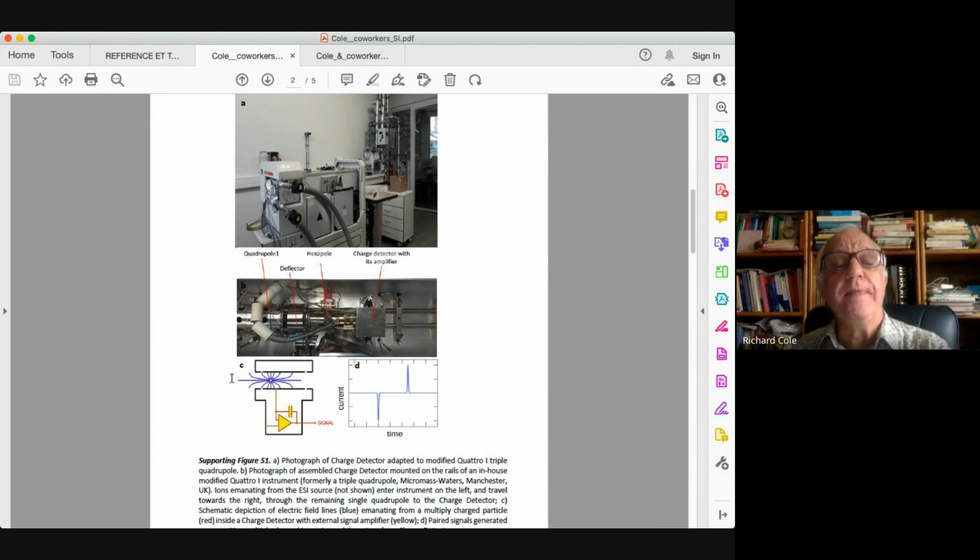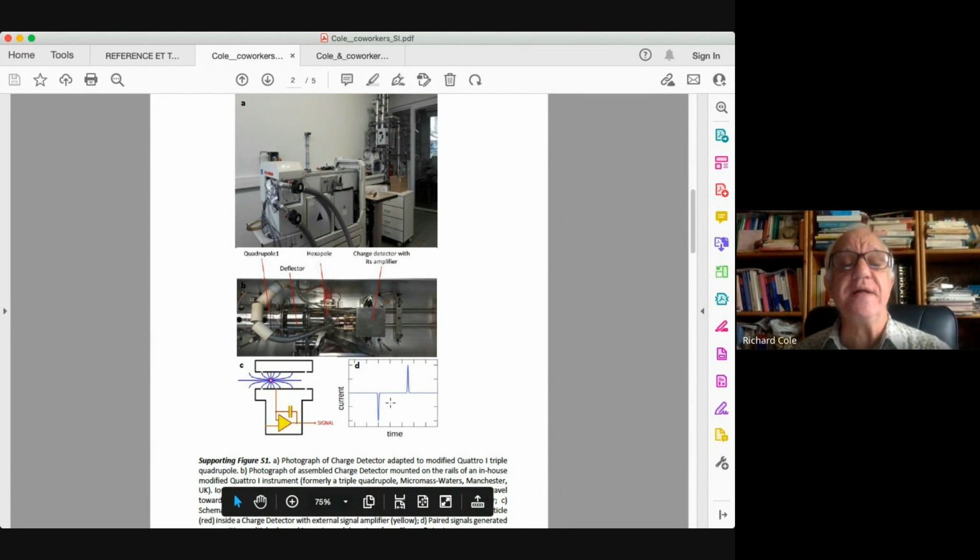As I mentioned, we've got a highly charged particle here, more than 500 charges, as it enters the tube. As this highly charged particle enters our tube, we have electrons that are attracted to the surface of the tube. That creates this spike related to this movement of electrons toward the edges of the charge detector tube.